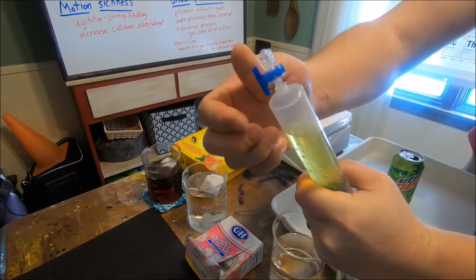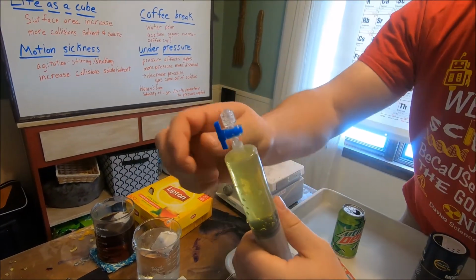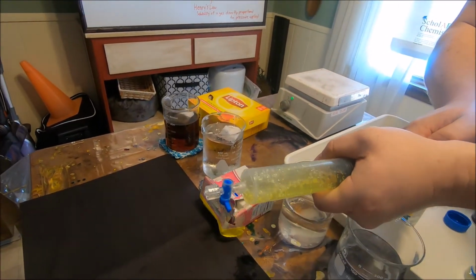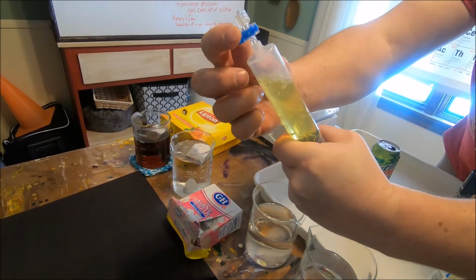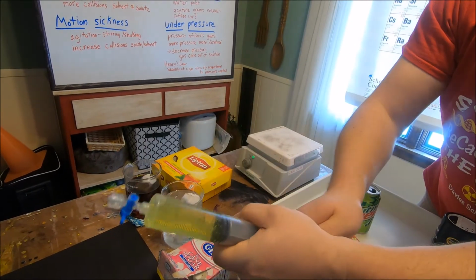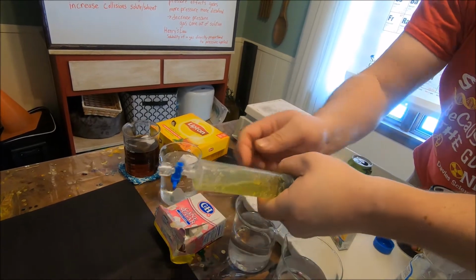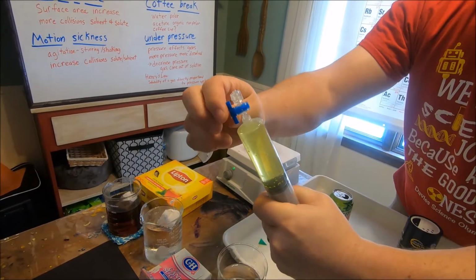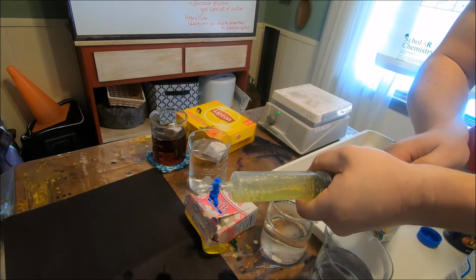Gases are much different in the fact that pressure affects the dissolving. The more pressure, the more gas can be dissolved. So if we pull, we're increasing the volume, so it decreases the pressure, so less gas is dissolved in the solution, and we can continue to pull more and more gas out of solution every time we increase that volume. So pressure is directly related. More pressure, more gas dissolved. The less pressure, the more gas comes out of solution.